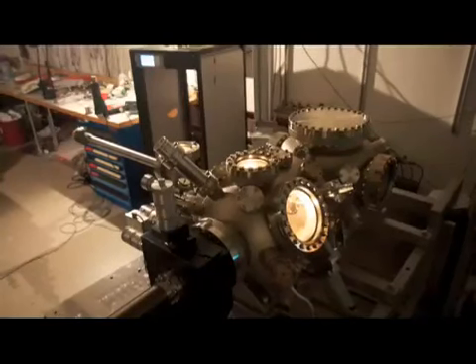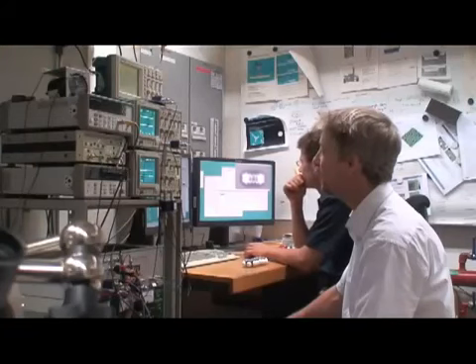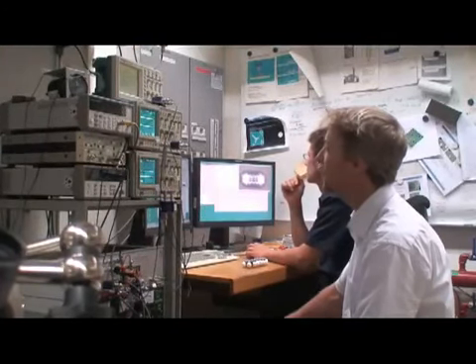This result marks a milestone in surface microscopy and further advances the exploration of electronic building blocks on the ultimate atomic and molecular scale. Commenting on IBM's long-term goals, scientist Gerhard Meyer adds, "Our long-term goal is to study electron transport in molecular systems or atomic scale processes in general on insulators and insulating films."